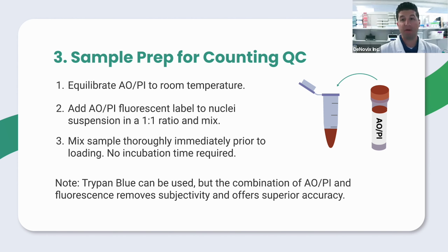I would like to point out that there is no incubation time required for AOPI, so it's not something you have to rock for 5 minutes or anything like that. It's simply mix 1-to-1 and input on the CellDrop. There's no wait time needed.